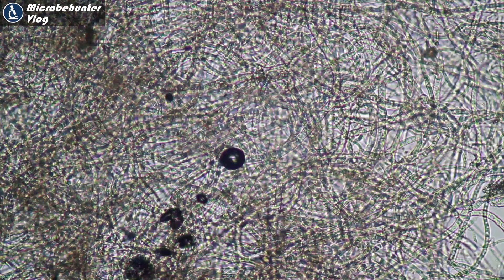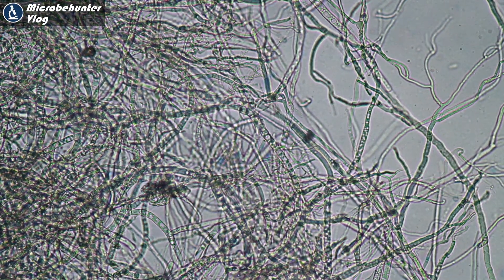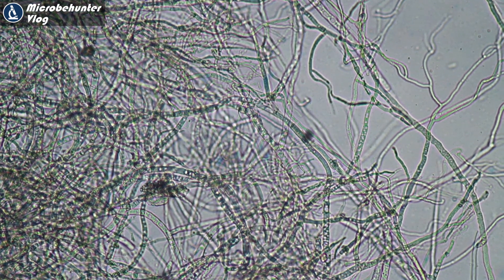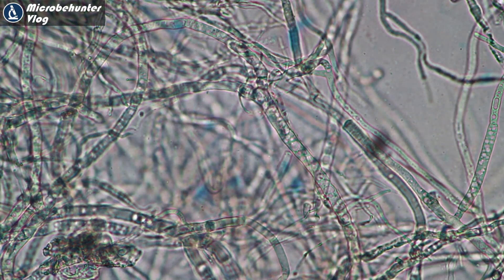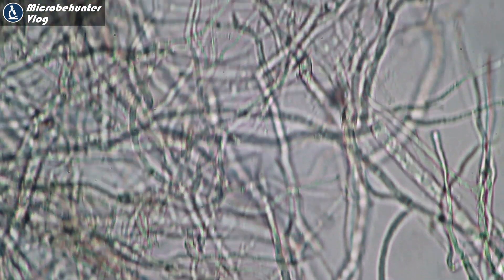That means we have to go to a little bit higher magnification — the 10x objective. And now we can already see the branched and string-like nature of the fungus. The strings essentially branch apart and diverge in this way.